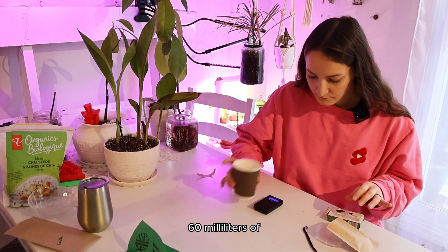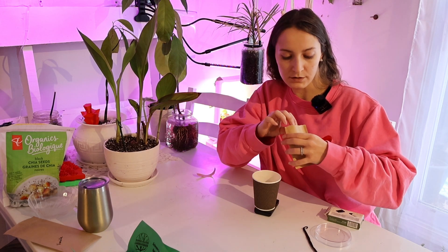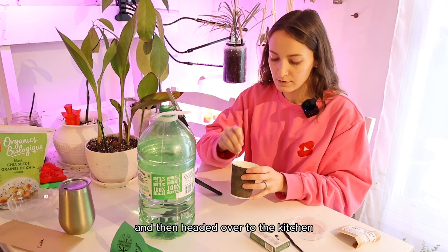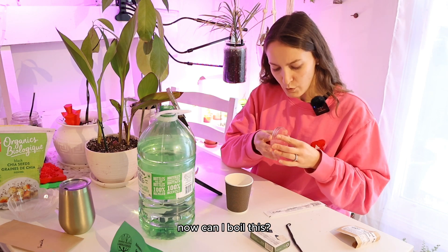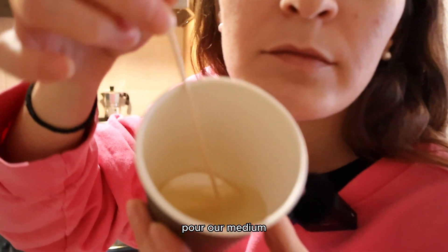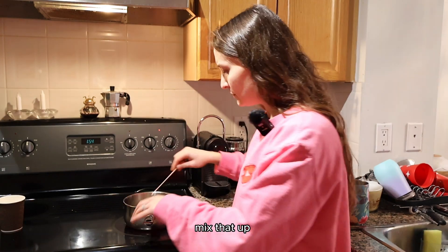I scaled out 60 milliliters of distilled water and added it to 1.8 grams of agar. It smells kind of funky. I mixed it up good with a cotton swab, then headed over to the kitchen to get this boiled up. I started to boil it and as I mixed it — it smells so bad.